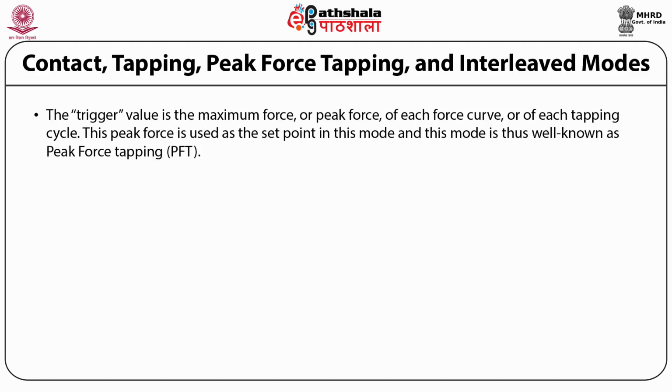Before the introduction of this mode, the legacy force volume imaging had been used extensively in biochemical and polymer mechanical investigation.